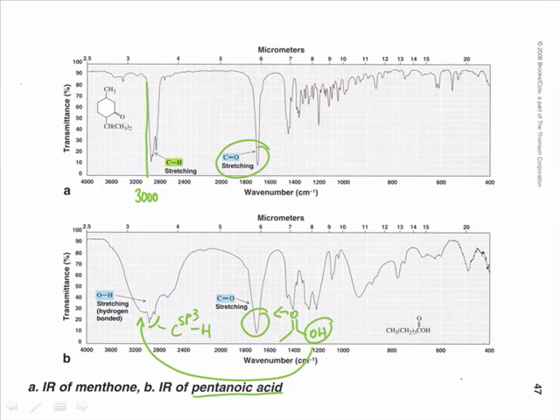And so this handful of spectra really shows us both the reach and the limitations of IR spectroscopy, because we can figure out what the functional groups are, especially if you have very polar functional groups such as carbonyls, OH groups, or carboxylic acids. We can also determine something about the hybridization of our carbons if they're bound to hydrogen.